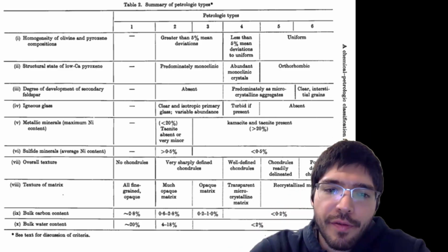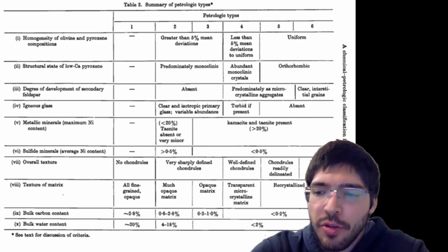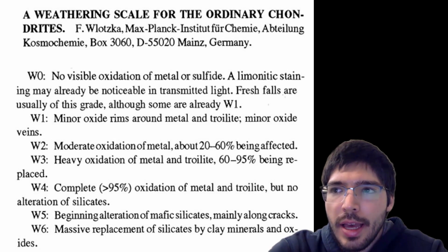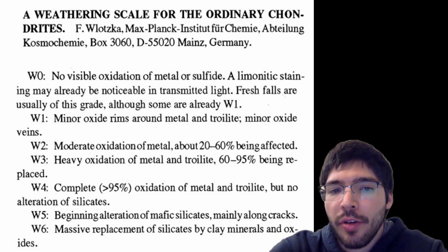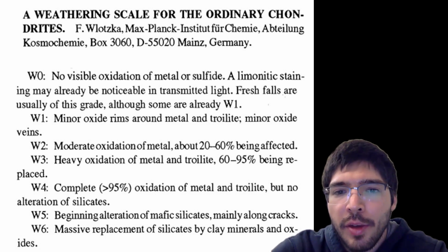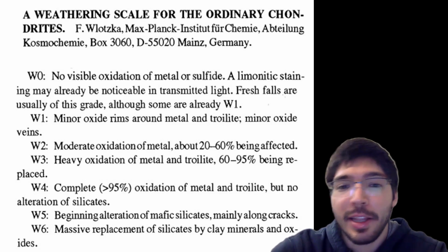Yeah, there's a bit of the experience factor that goes into this, but there's also the fact that every person who classifies a meteorite is going to have their own touch on how they do this. Like I think we talked about a few years back about lumpers and splitters.